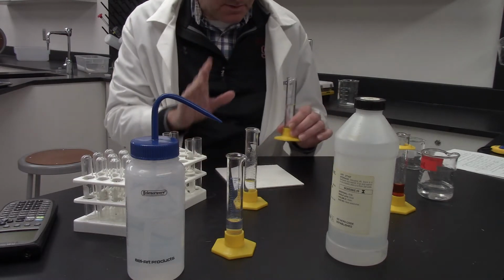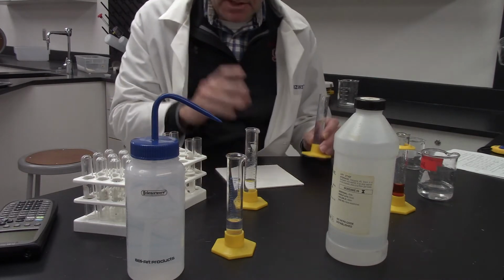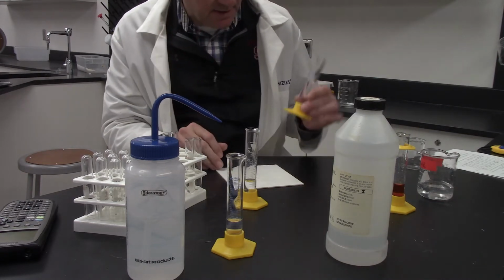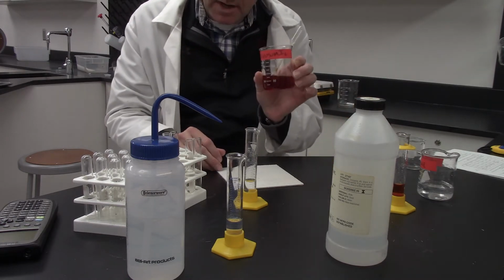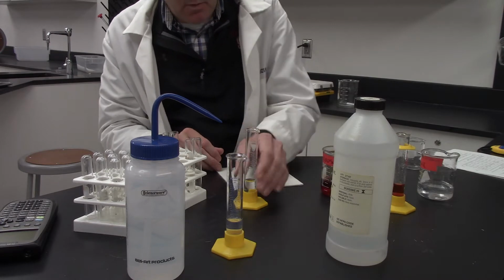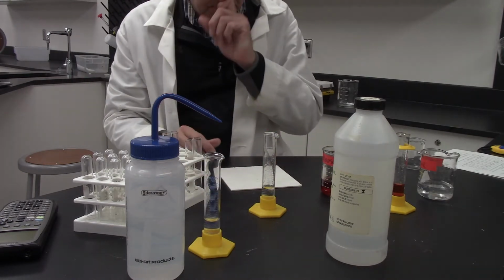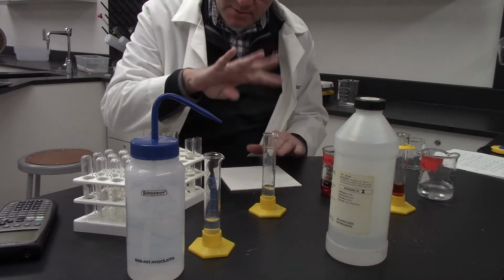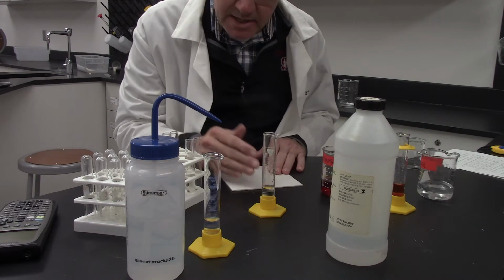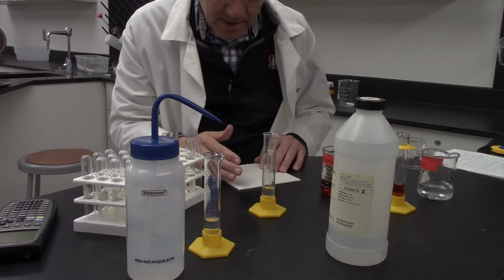What we're going to do in common to all of these reactions is manipulate the concentration of 3 different things: our 4 molar acetone, our 0.005 molar iodine, 1 molar hydrochloric acid, and water. We're going to mix these all together, and by running 4 different reactions, we're going to look at how the concentration affects the overall rate.